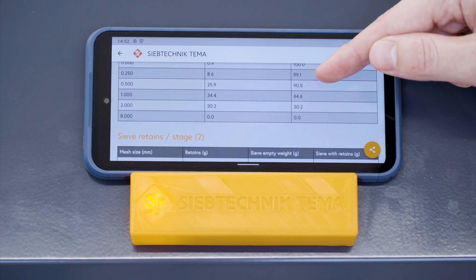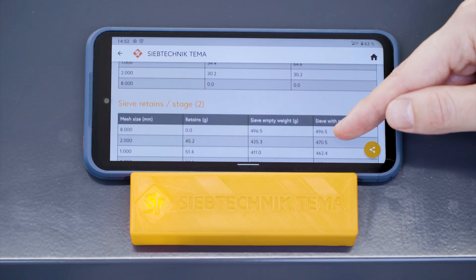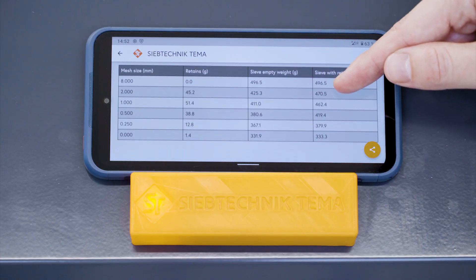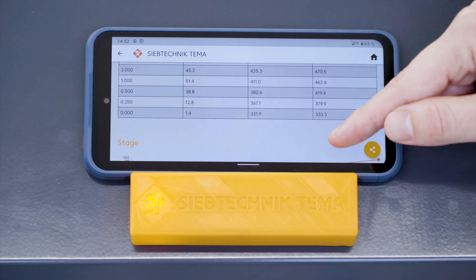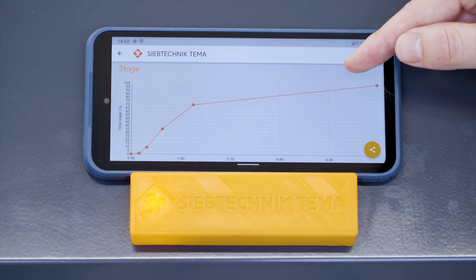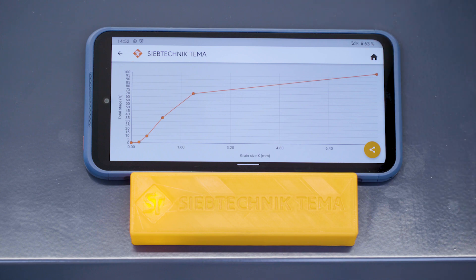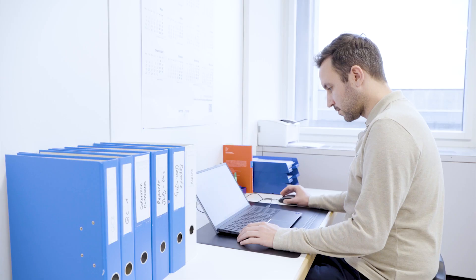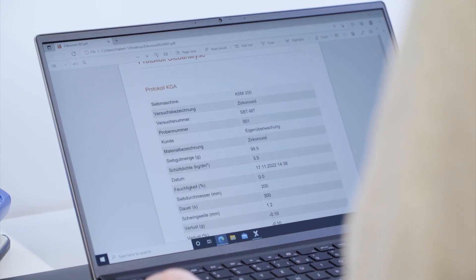For each sieve, fractional weights are calculated automatically, and the distribution percentage is displayed in the test protocol. All weighing data, including machine data, is automatically stored in a report that can be saved and sent digitally or printed out.